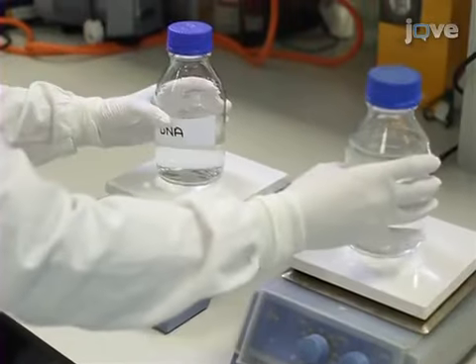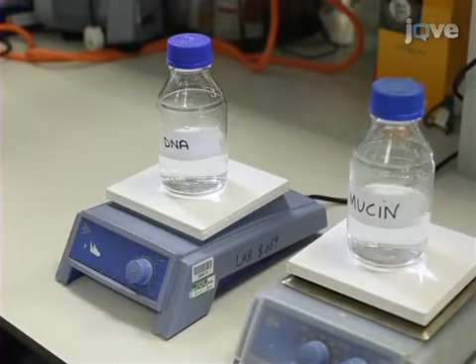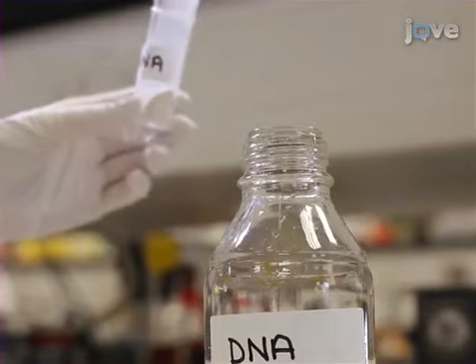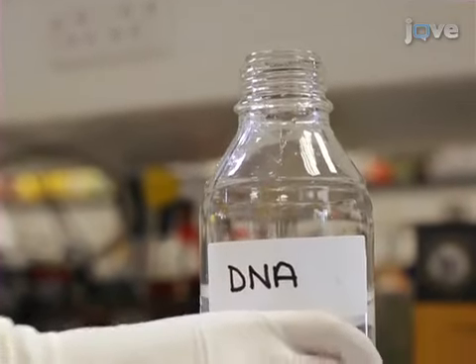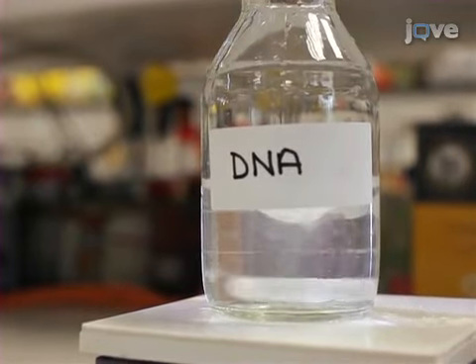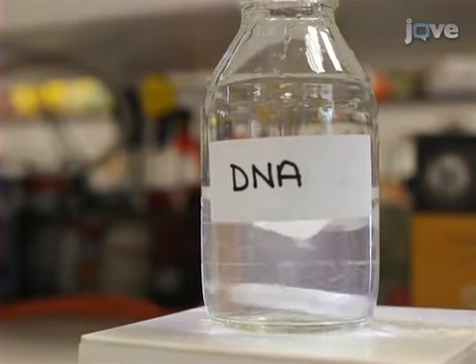To make the medium, first prepare 2 bottles containing 250 millilitres of sterile water. In the first bottle, gradually add the stirrer and then add 4 grams of fish sperm DNA to 250 millilitres of sterile water. Stir the solution at room temperature and allow the DNA to dissolve.